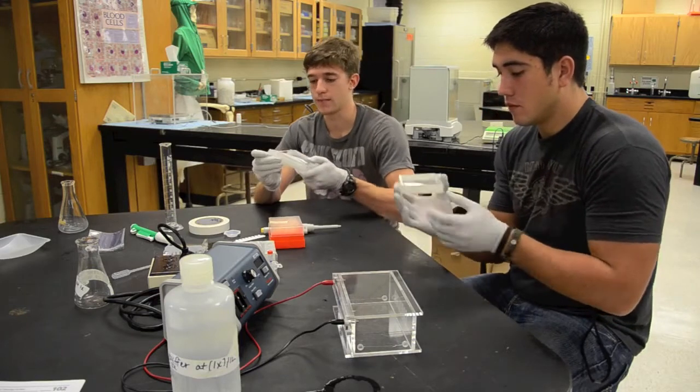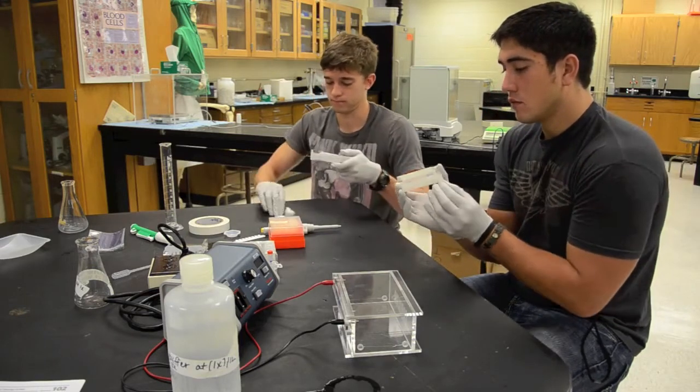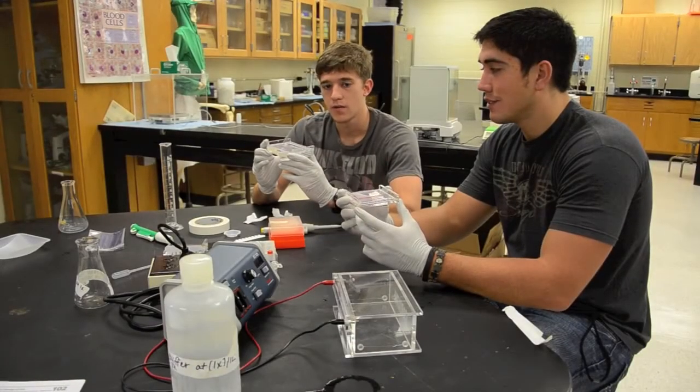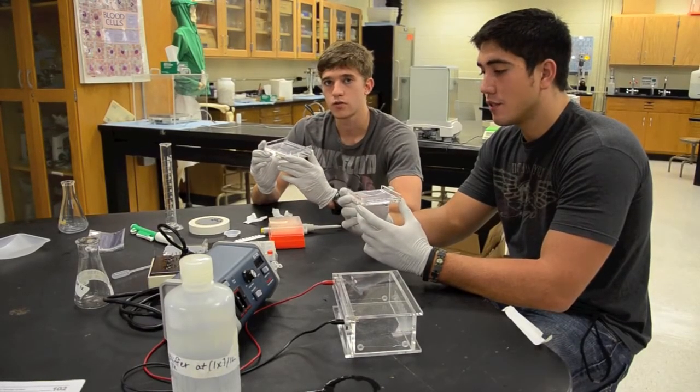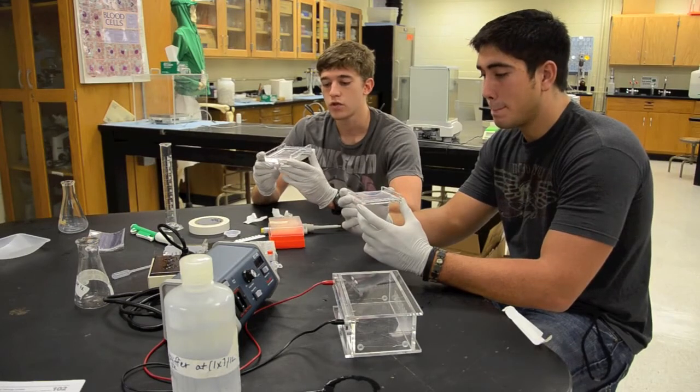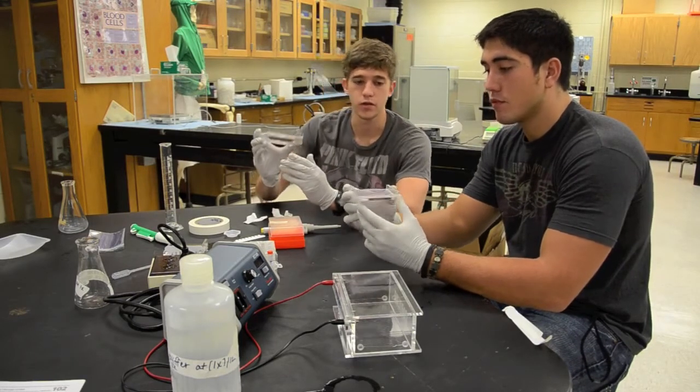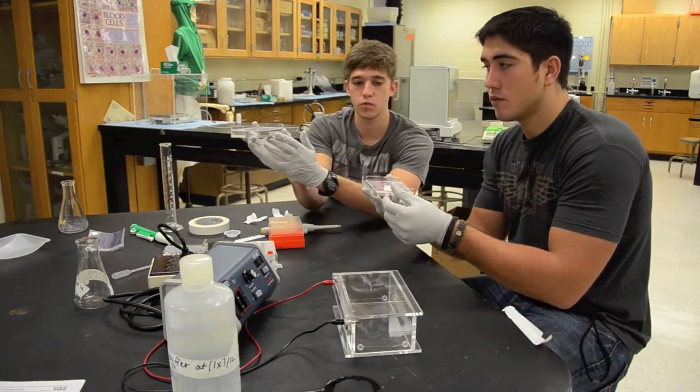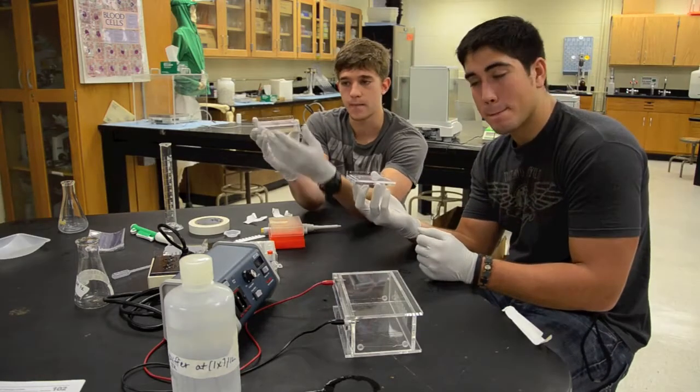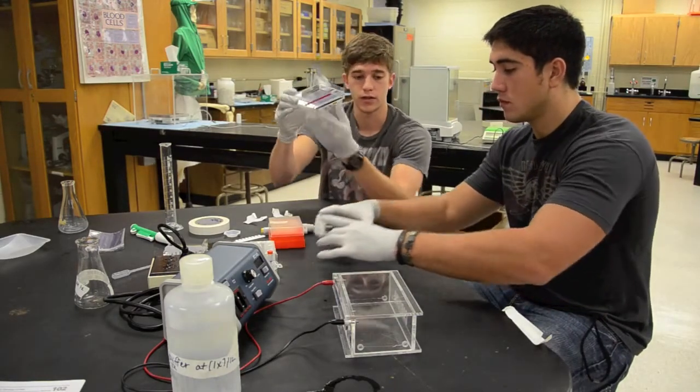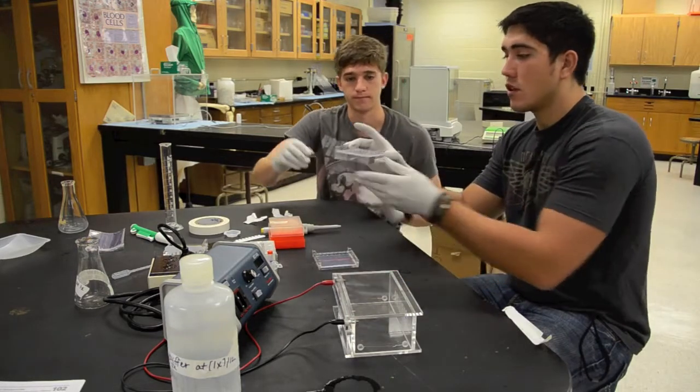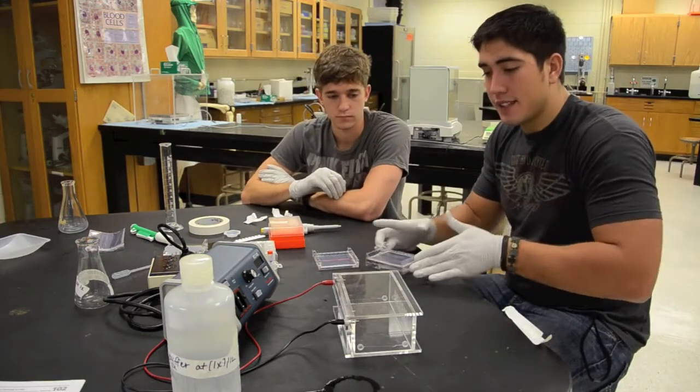Now that we've removed the comb and we have our wells it's time to load into the electrophoresis chamber. Now to do this you're obviously going to first want to remove the tape. Now before loading into the electrophoresis chamber it's important to check which plate you have. There's two different sizes, you have a thick base one and a small base.